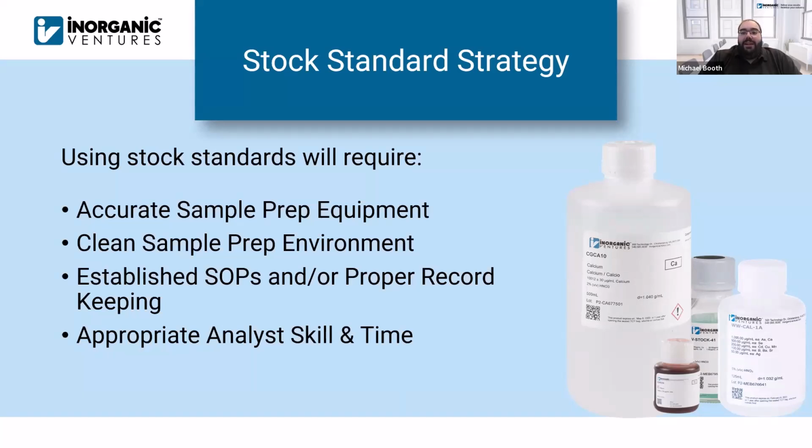So if you are a lab that gets audited, and you're making your own working standards, that is something you want to make sure you have nailed down really well. You have this chain of traceability for how that working standard got made, and make sure that it's made correctly. And then also, making working standards can be a little bit difficult depending on what you're trying to do. So make sure that you have the appropriate experience level and the time to put those together.